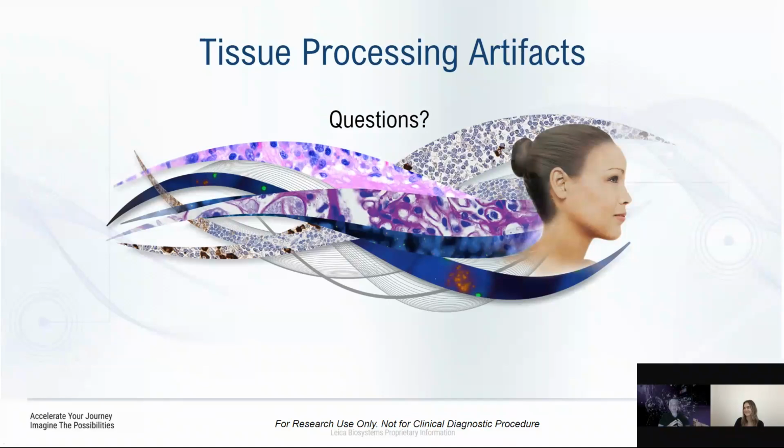That's good. Very good. Because on the basic end, this isn't rocket science, but I think a lot of times we get so busy, we kind of overlook the fundamentals. And if we can get the foundation right of getting the tissue fixed, getting it properly processed, everything downstream doesn't have to be repeated, doesn't have to be troubleshooted, because everybody knows it can take a lot of your time to try to figure out where that root cause is, for sure. Absolutely. Thank you, Robin.